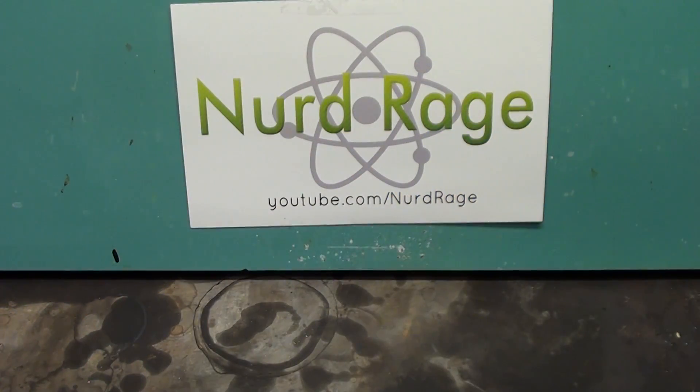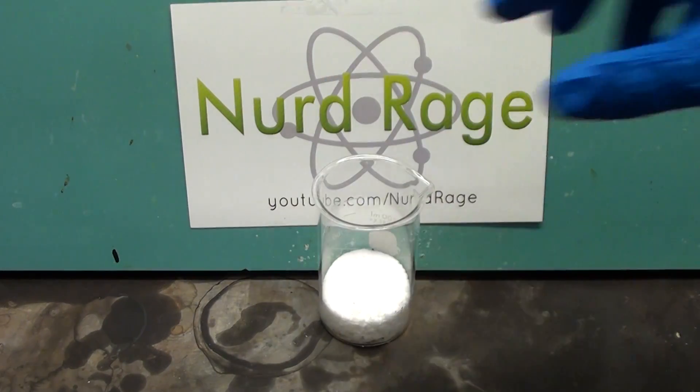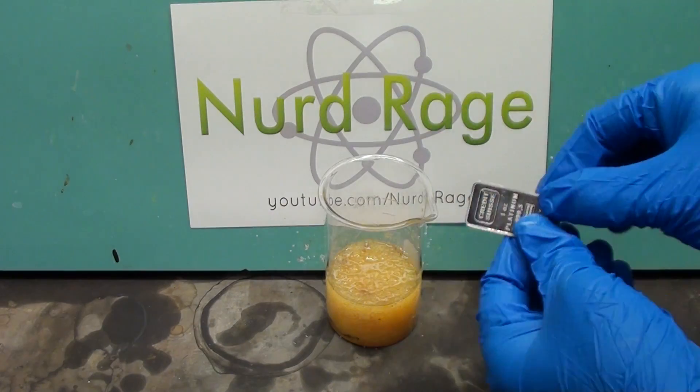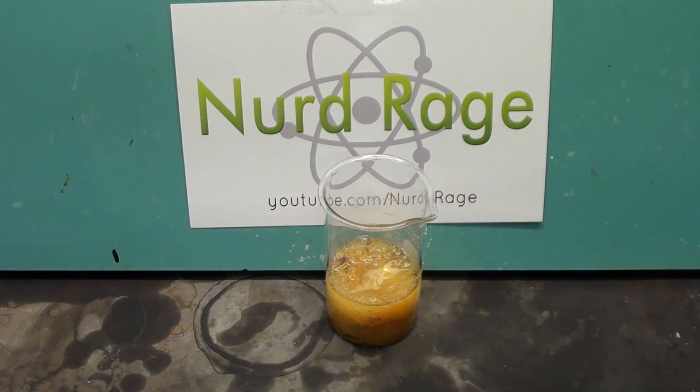Now for the sulfuric acid test. I have here some sugar and I'm adding to it some concentrated sulfuric acid. Let me toss in the platinum bar and now we wait.